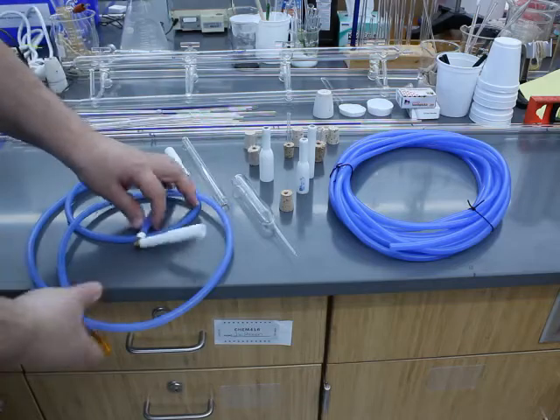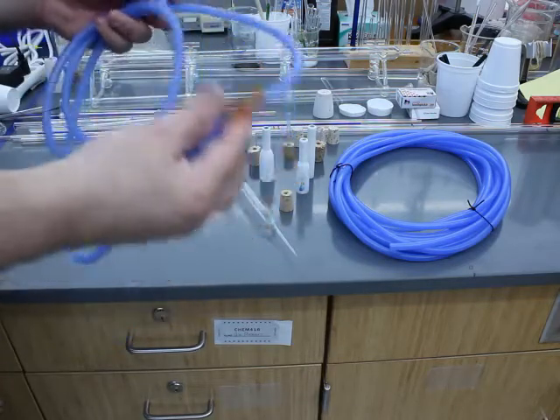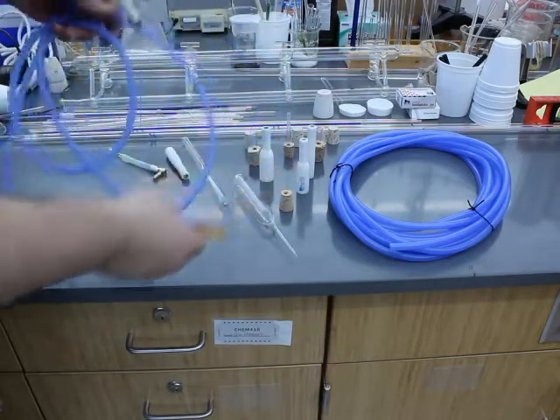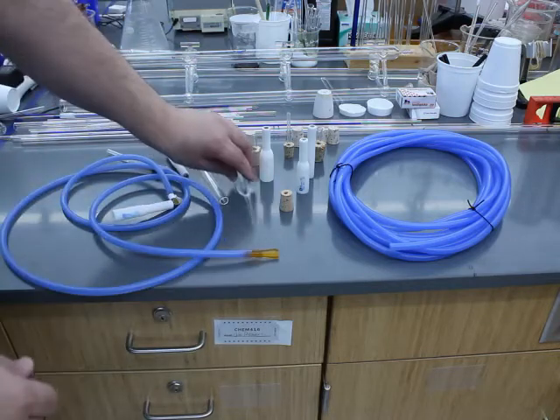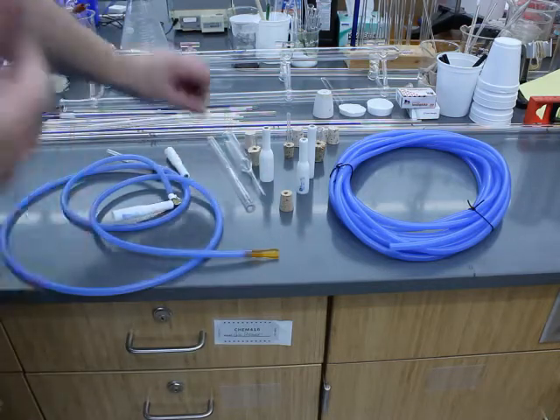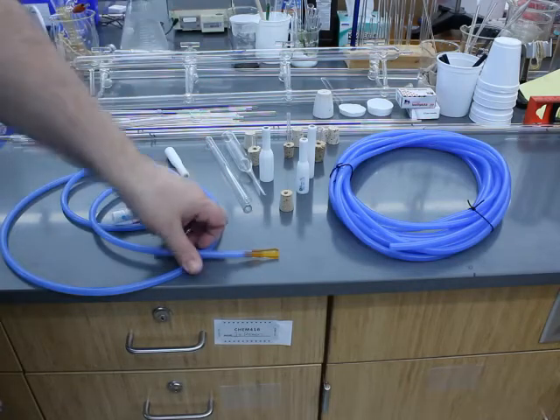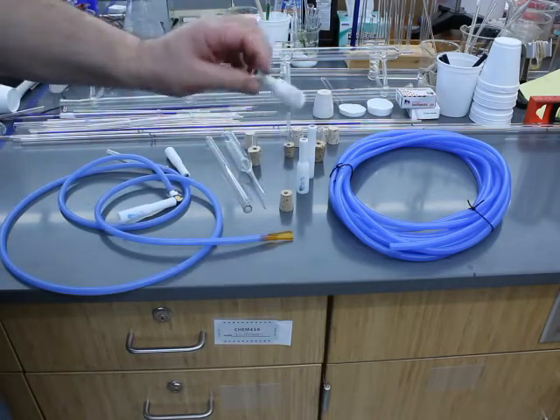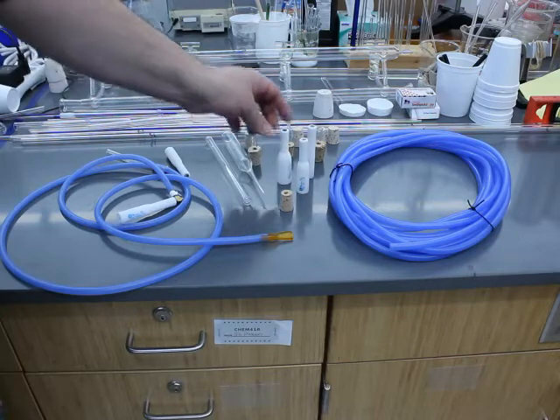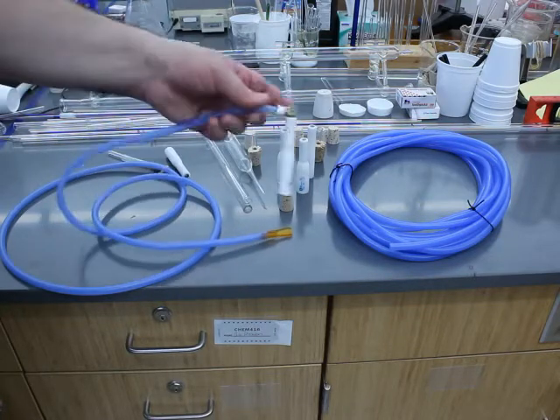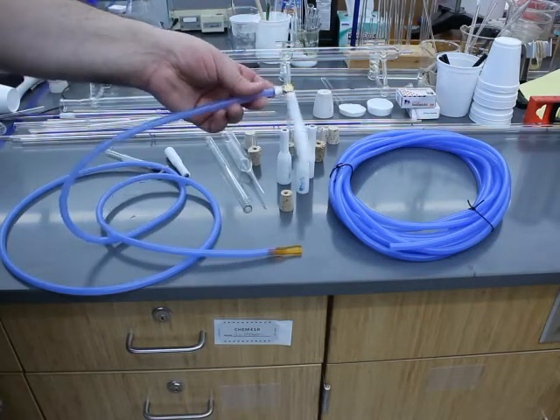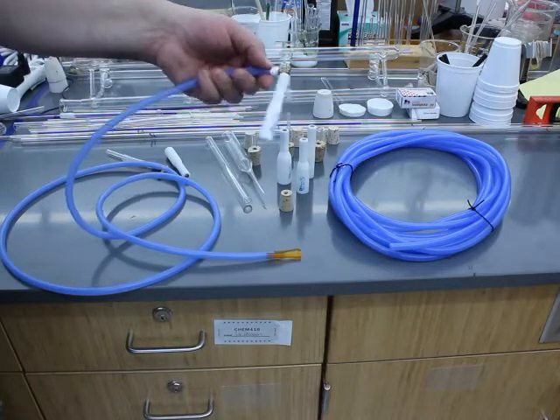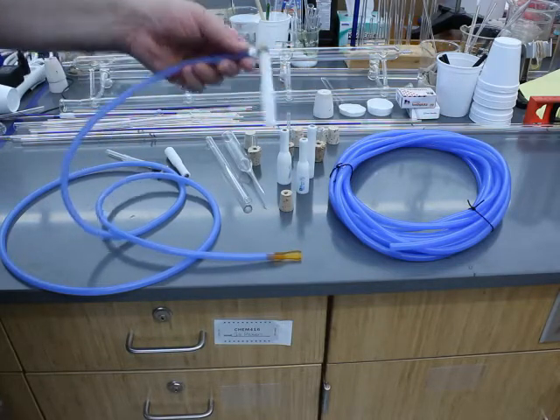And the blow hose is something very straightforward, something that if you're serious about learning glassblowing, you should definitely get some nice tubing if you can afford. They're not that expensive getting the silicone adapters. A swivel can cost you about $10 to $15 in that range.